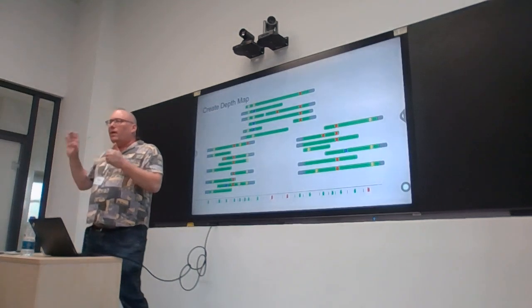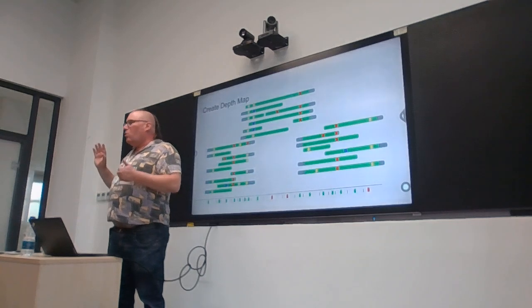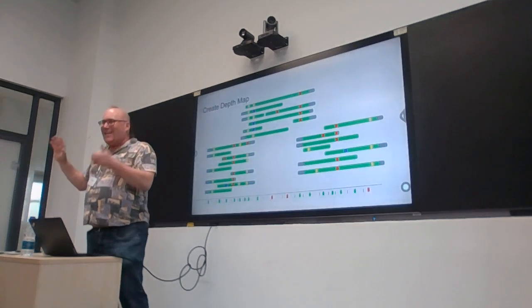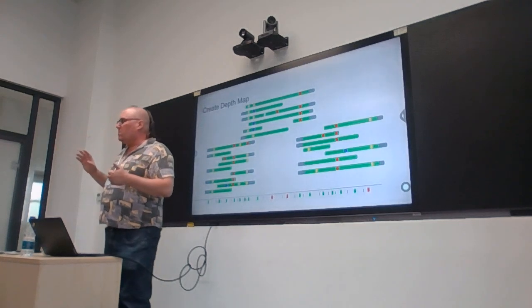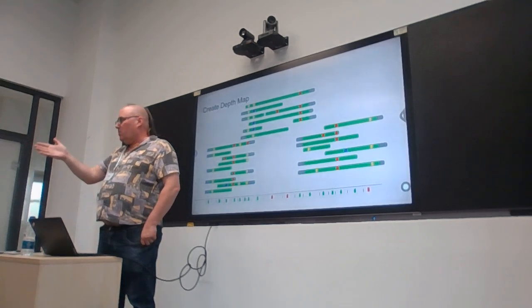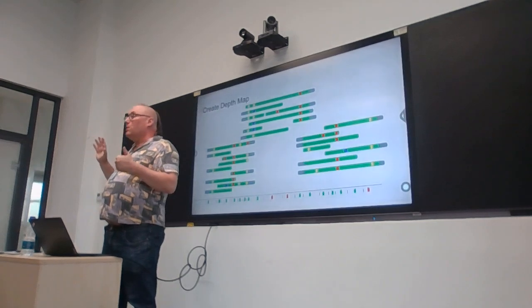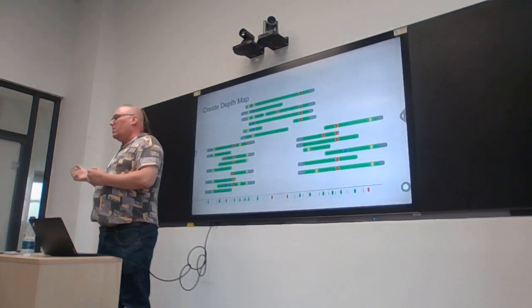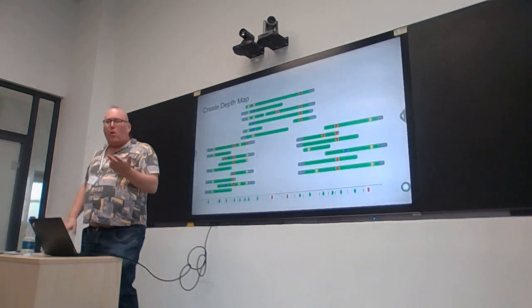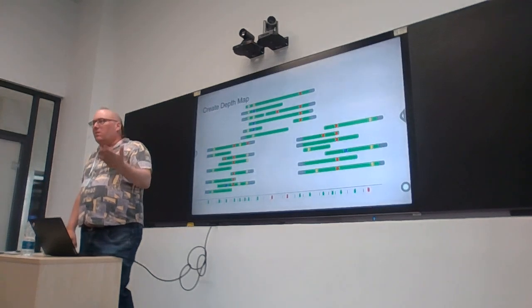I suspect that if you are sequencing Mpox virus in your countries, you're mostly going to find exactly identical sequences. Naomi, are you seeing a lot of very similar sequences in your Burundi sequencing? Mostly you're going to see exactly identical sequences. So in 1 year we'd expect about 12 mutations in SARS-CoV-2.